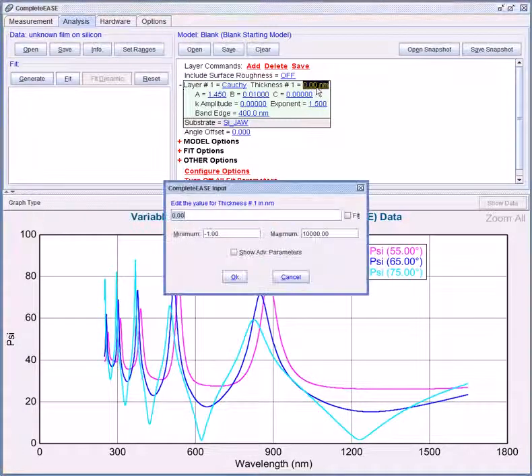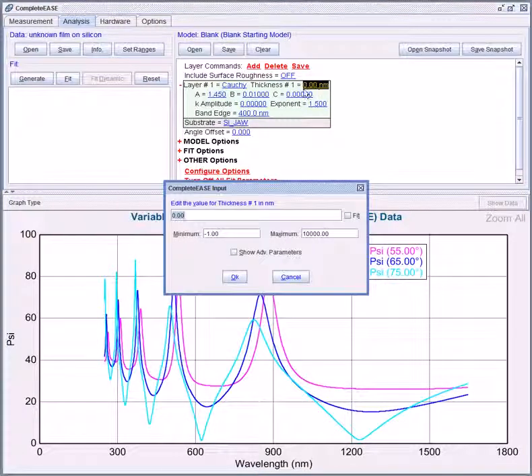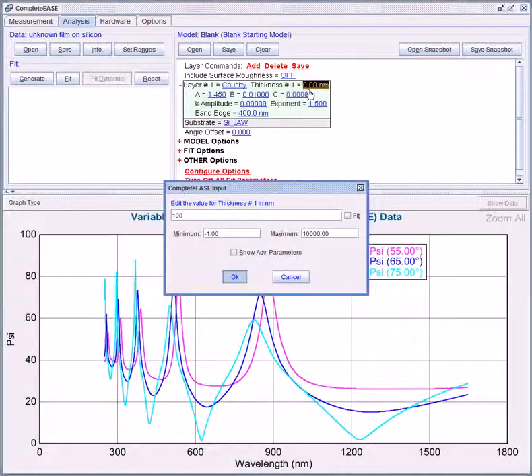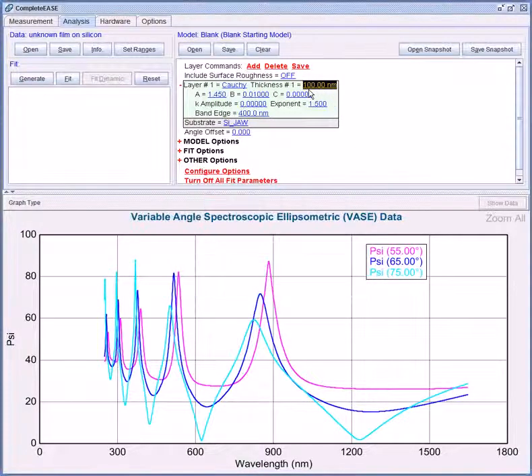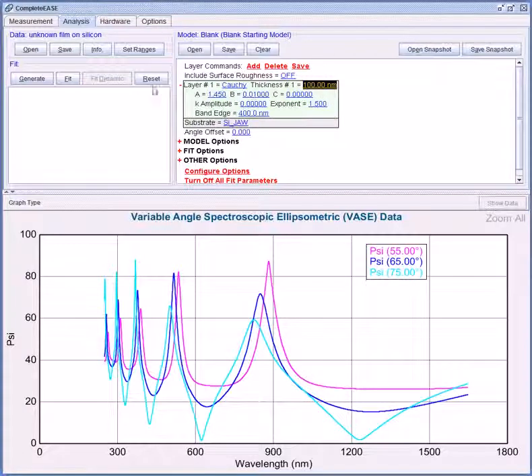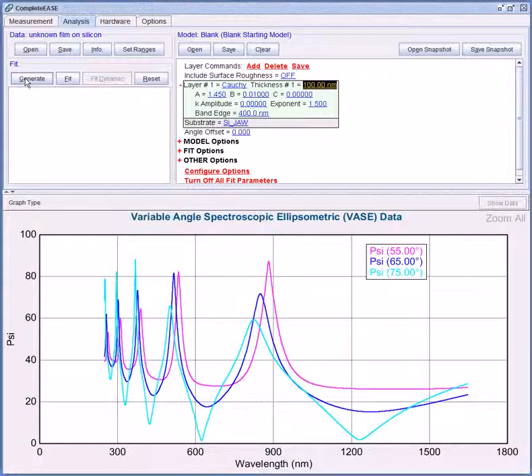You can enter a starting thickness value by clicking on the thickness here. Once you have a starting thickness guess click generate in the fit panel.